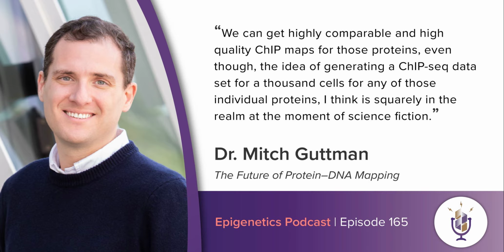Yeah, so all of the methods that you mentioned, ChIP-seq, cut-and-run, cut-and-tag, generally work by mapping a single protein to DNA at a time. And they work really well. There have been a lot of innovations even amongst those methods over the years that have really improved resolution, cell numbers, and many other important aspects of the ability to map DNA-protein interactions. But fundamentally, all of these methods work by mapping a single protein at a time.